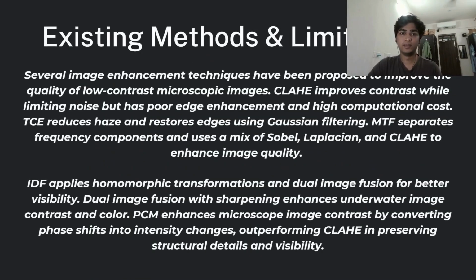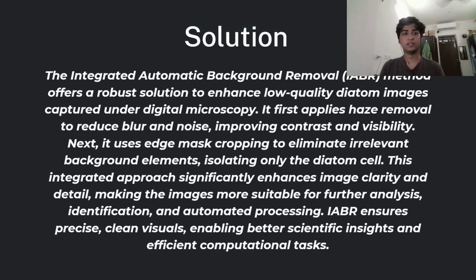So currently there are many existing works in this field, such as CLAHE, TCE, and MTF contrast enhancement. However, solutions such as CLAHE improve contrast while limiting the noise but have poor edge enhancement and high computational power. Similarly, TCE and MTF also suffer from poor edge detection. So our solution to this is the integrated background removal method, which offers a robust solution to enhance low quality diatom images captured under digital microscope. IABR ensures precise, clean visuals, enabling better scientific insight and efficient computational tasks.